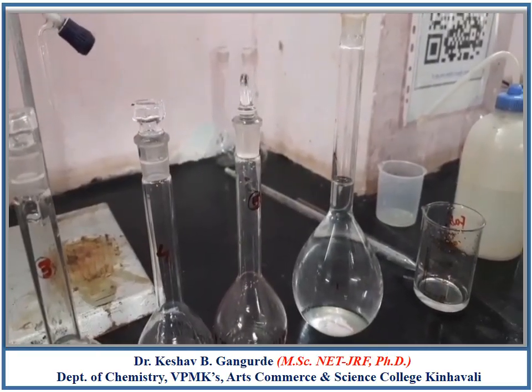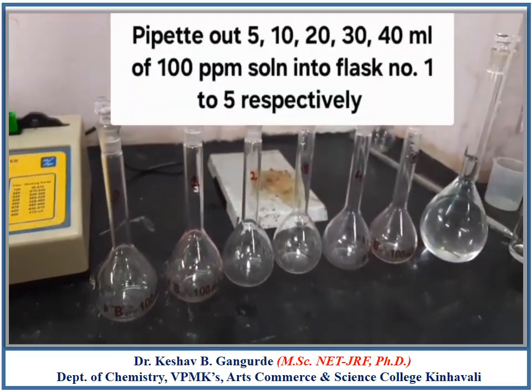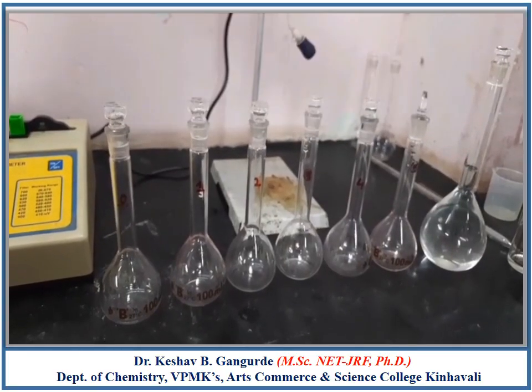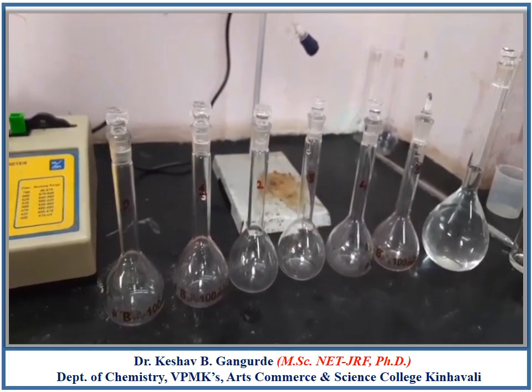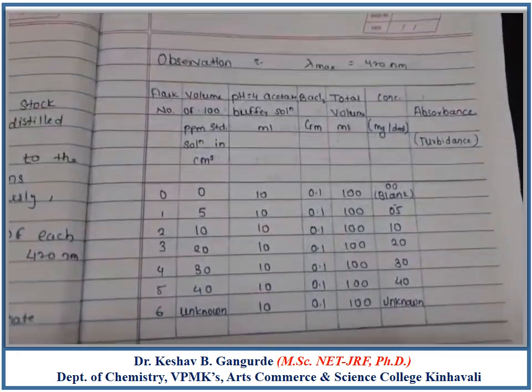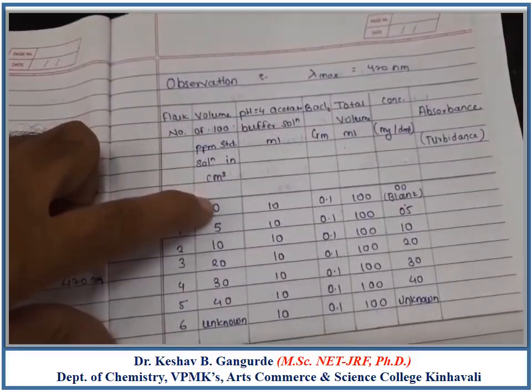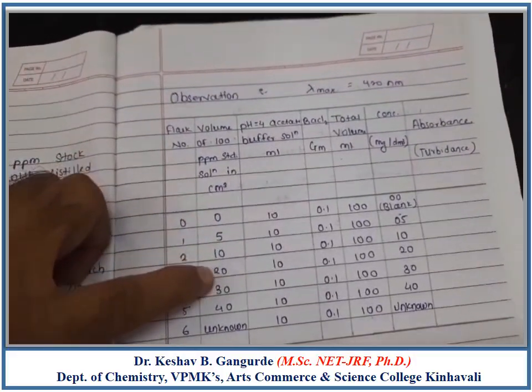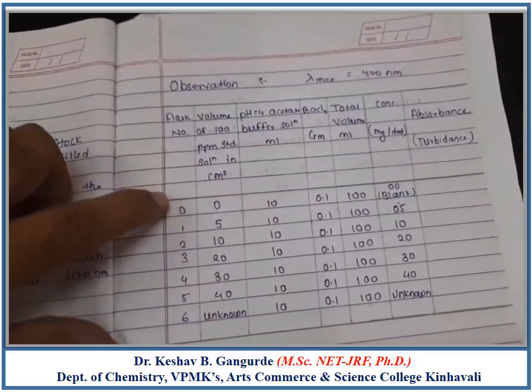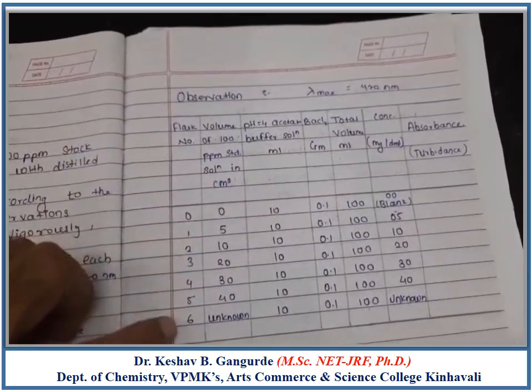From this 100 ppm Sulphate Iron Solution, prepare 6 standard solutions for the calibration curve. Pipette out the 100 ppm standard solution in the order of 5, 10, 20, 30, and 40 ml into flasks numbered 1 to 5.